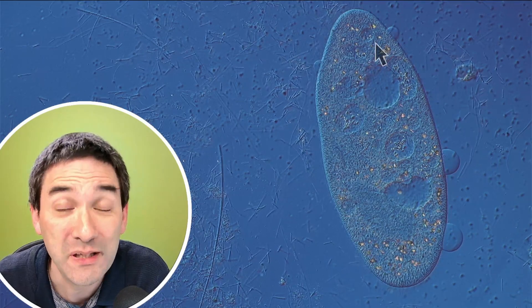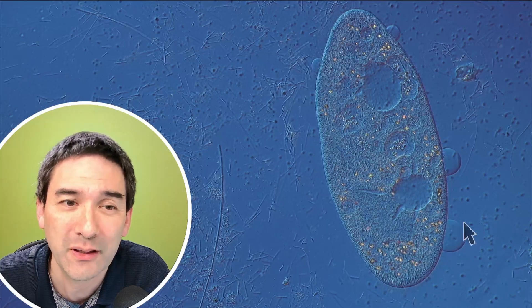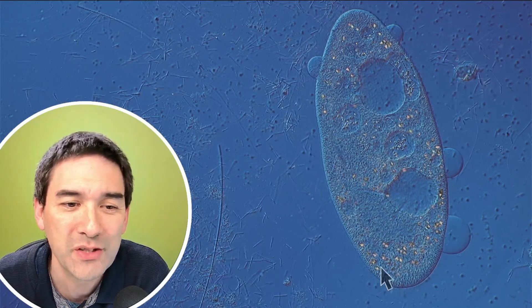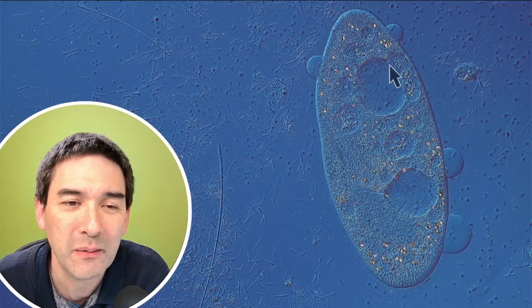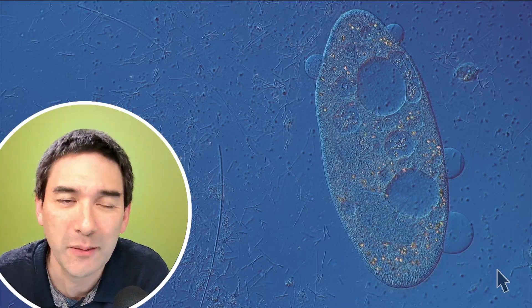Let's see if one of them is going to collapse after a couple of seconds or not. But I think this cell over here is probably not quite as happy. Look what's happening on the outside here. You see those little round structures? This cell is now in the process of being squeezed to death. The pressure of the cover glass is too high. What happens now is that the cytoplasm starts to spill out of the cell. This actually seems to be one of the contractile vacuoles, which is there for pumping out water, being also pressed apart. So this cell is not happy and is now basically not going to survive for very long. But you can still see there's still a little bit of movement going on here. Some of the cilia are still working. But this is going to stop quite soon. So what I'm going to do now is wait a couple more minutes and see how the situation develops here with this cell.